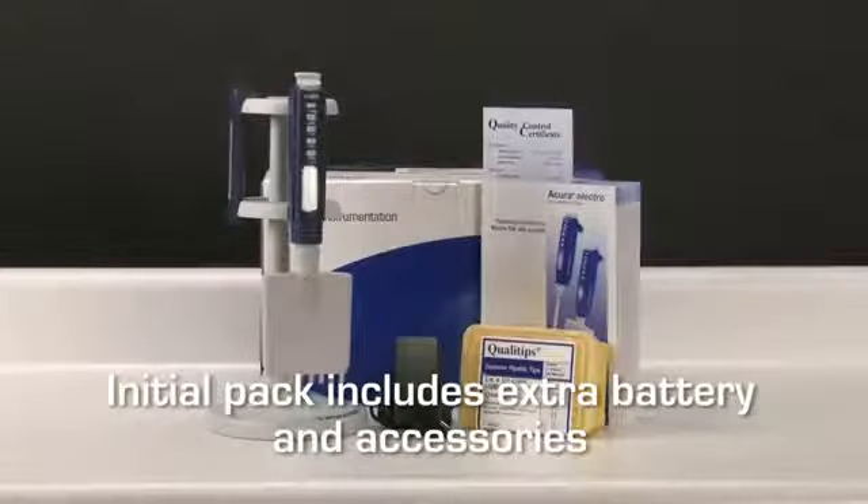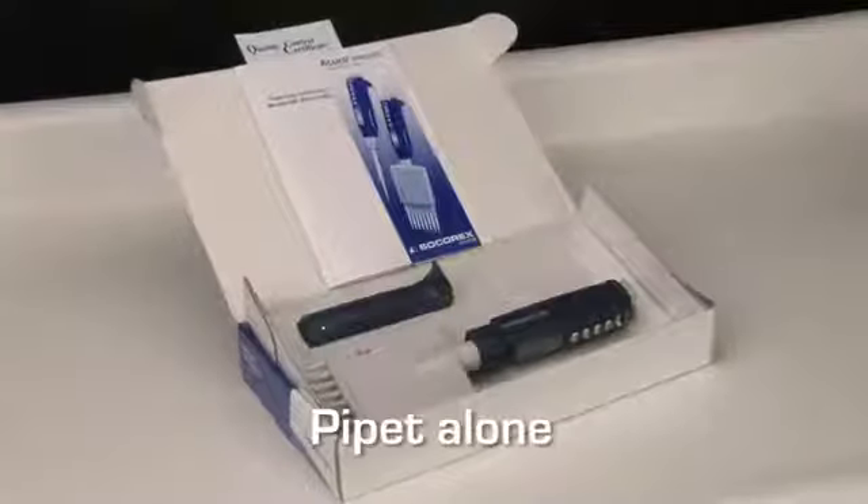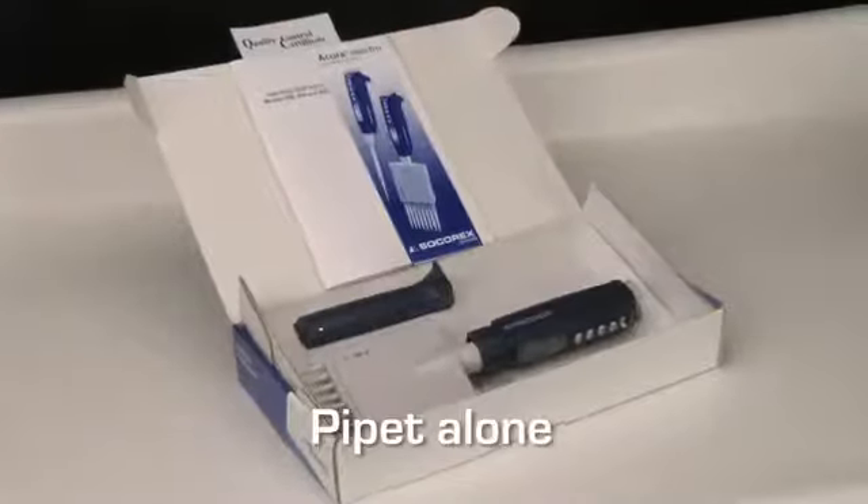Acura Electro is available as an initial pack, including a complete instrument and charging devices. If the charging stand is already available in the lab, additional instruments may be purchased at a lower price.